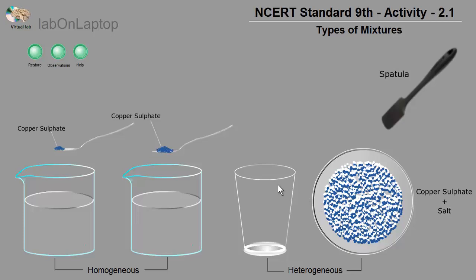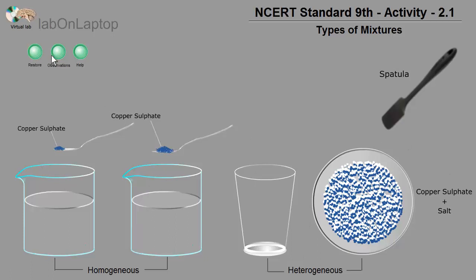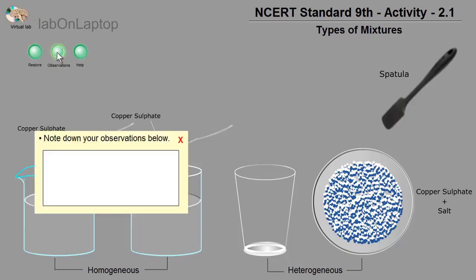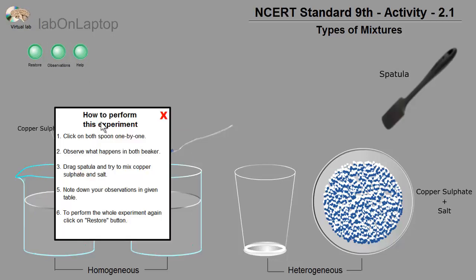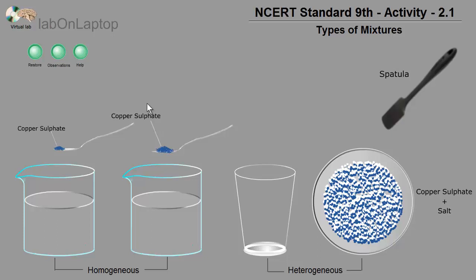First, let's see what has been given here. I have explained these 4 things. You have a restore button — if you want to repeat this whole experiment, click the restore button and it will come back to the same starting position. Here, you have to note down your observations in the observation table. And there is also a help section that you can use to learn on your own.